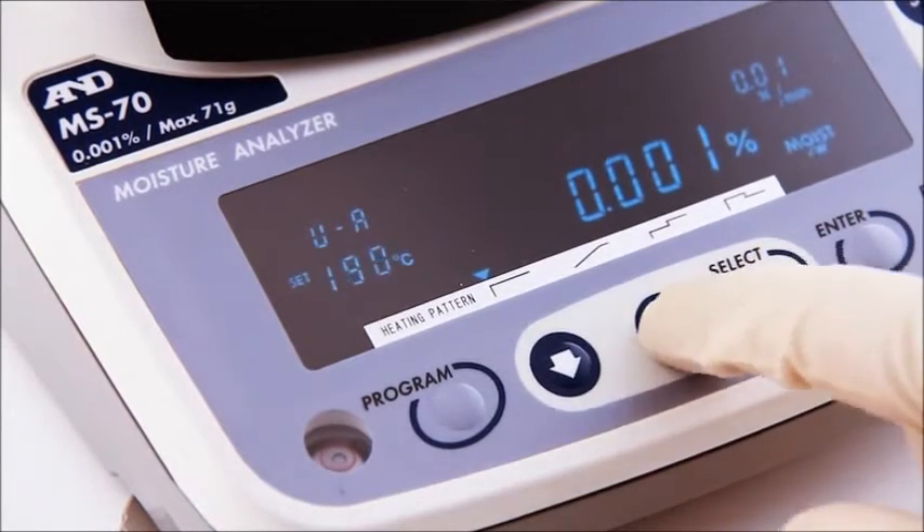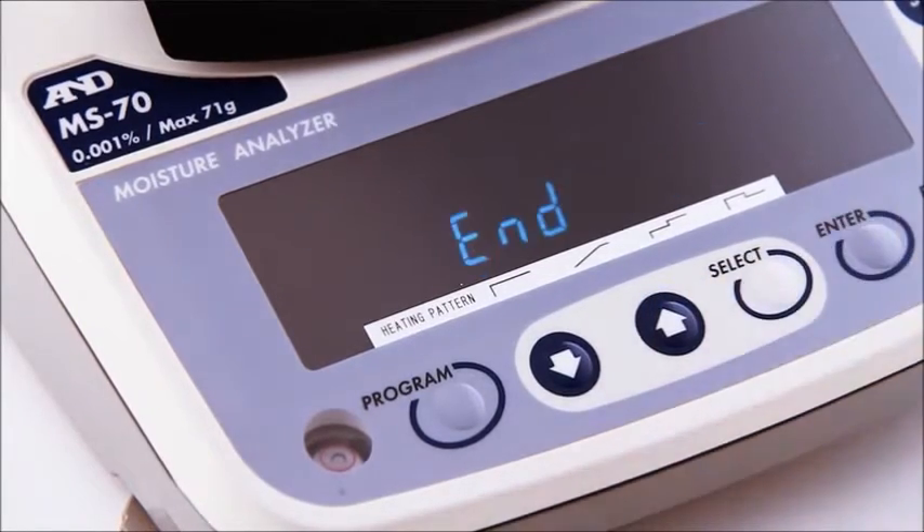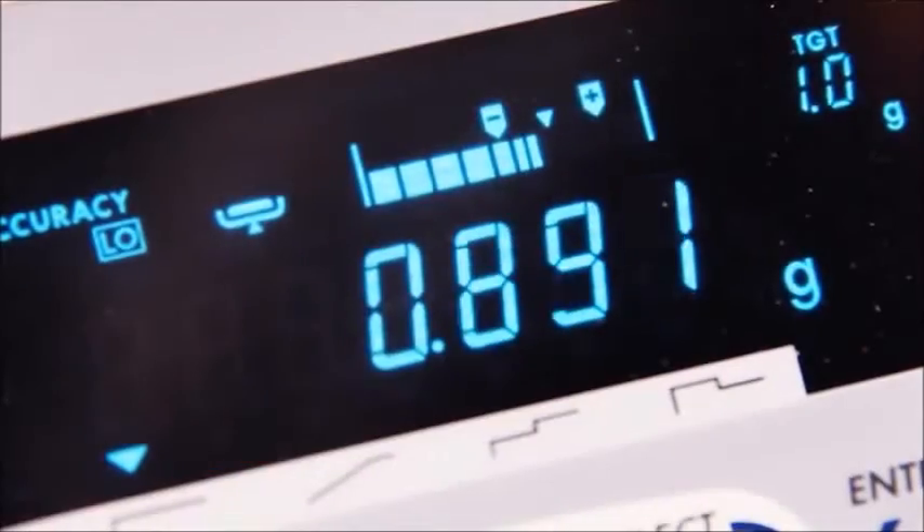By setting the temperature and the final drying rate, you can establish a repeatable process. A range of intelligent features helps assure accurate results.